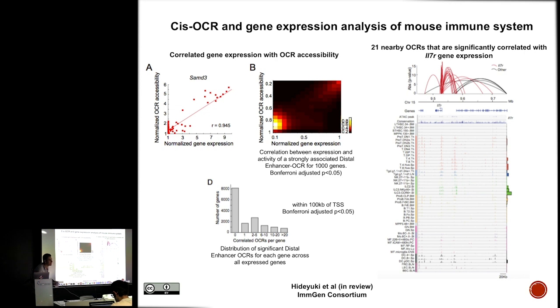So I've read some papers where they not only look at accessibility, but also at the shape of the peak. And they try to infer some regulatory properties. I guess that with this data set, you could see shapes of the peaks and genes in differentiation. We talked about looking at shape profiles, but we ended up not looking at that in the end. I think we don't have enough depth. The data is sequenced to about 10 to 20 million reads, so the shape would be nice with deeper data. It could resolve some things, and I think looking at nucleosome structure and the shape at the promoters would be very interesting, but it's something we didn't have time to get to.